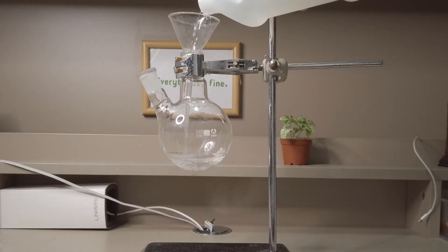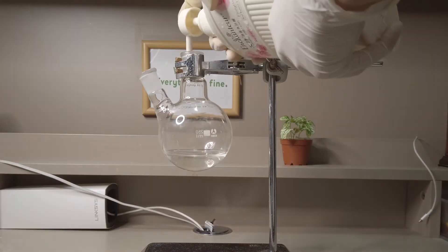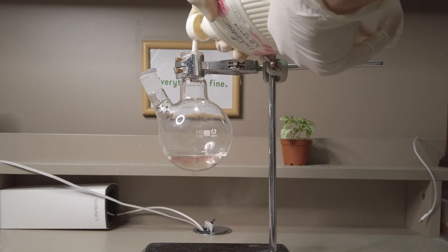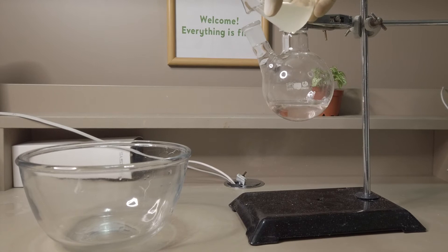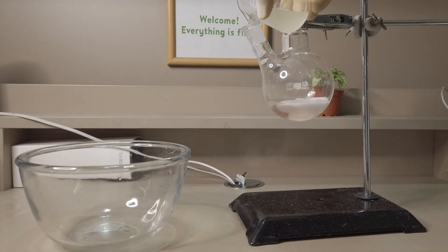Into a two-neck round bottom flask we poured in a very small amount of hydrogen peroxide followed by some soap. For the reaction to begin we poured in our sodium iodide solution.